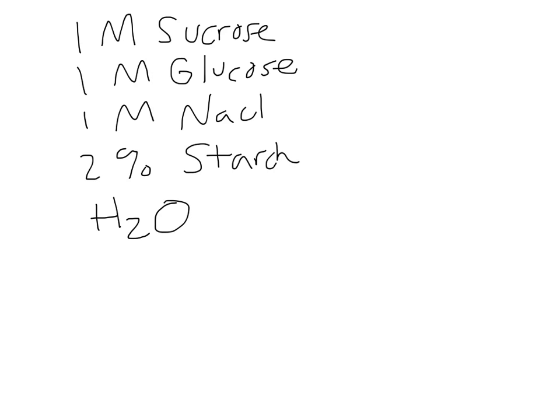And then you're going to think about your last lab, the one before the cell lab, on molecules. How would you know if glucose or starch moved in and out? So what tests did we do for that lab?